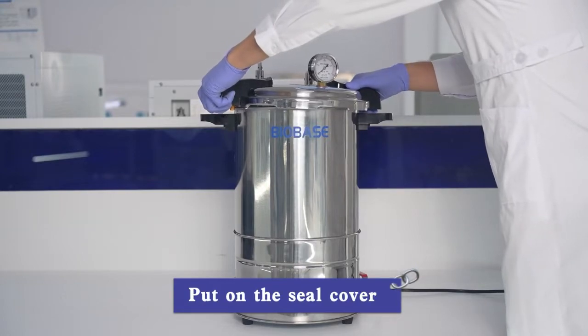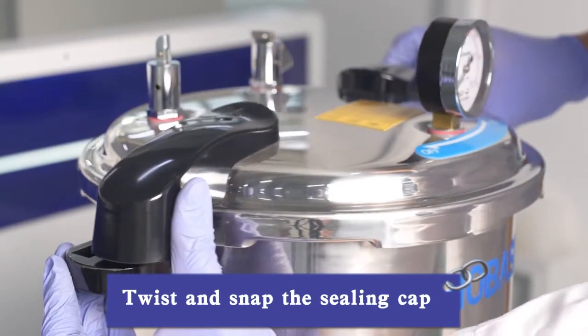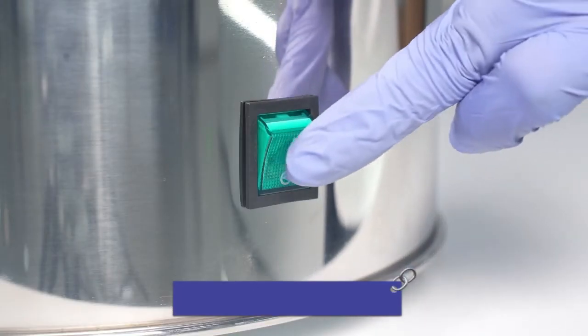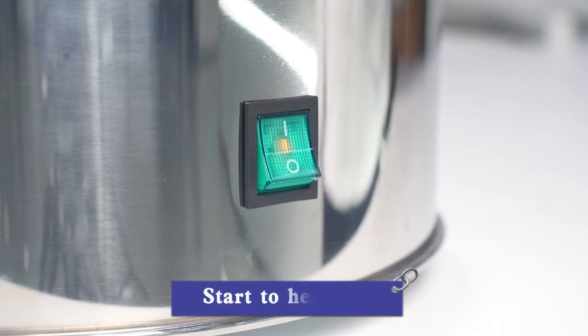Put on the seal cover. Twist and snap the sealing cap, then open the exhaust valve. Turn on the power and turn on the switch to start heating up.